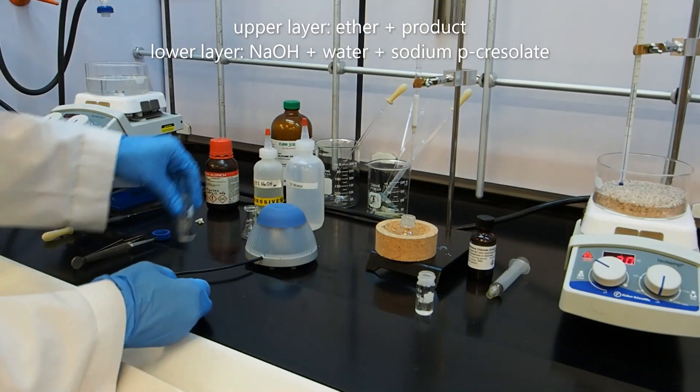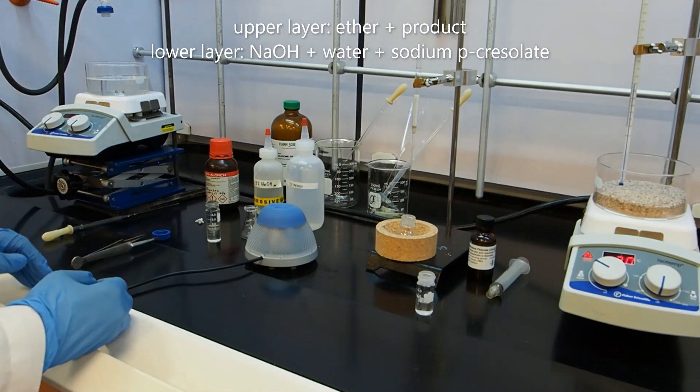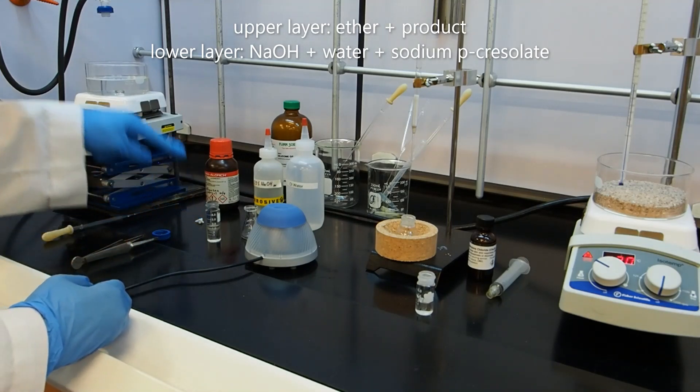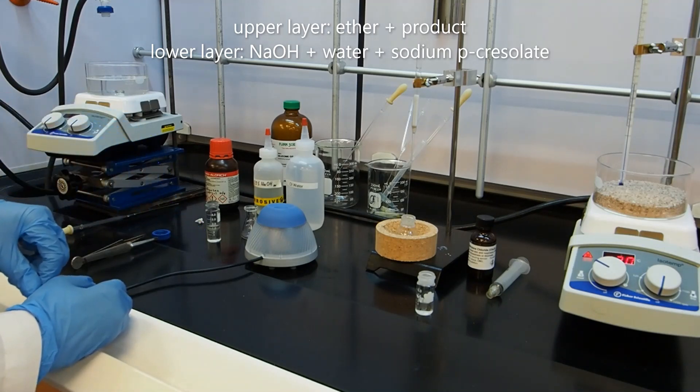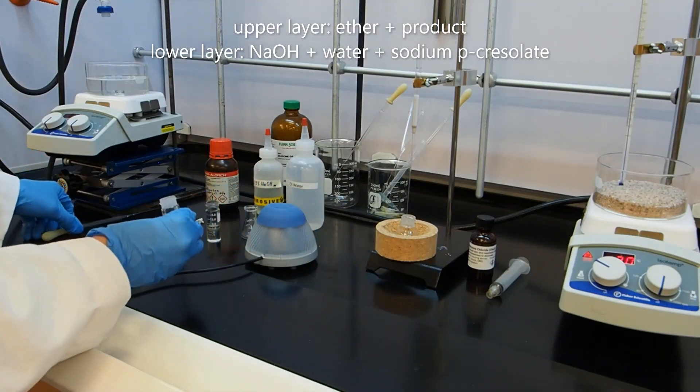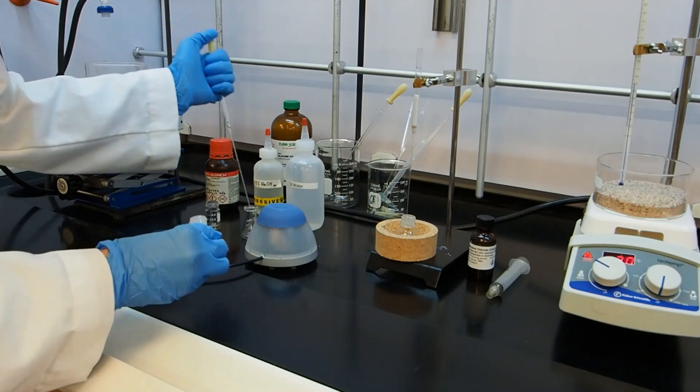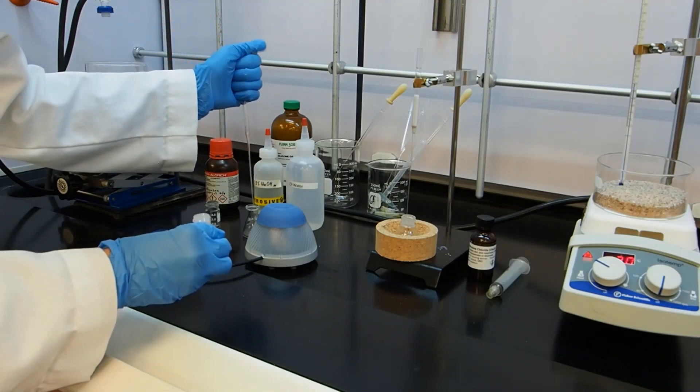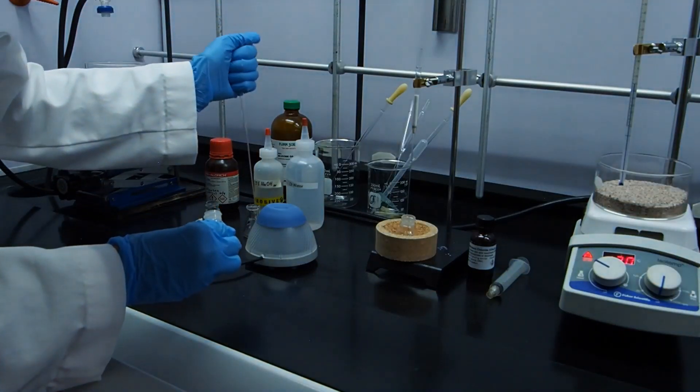So I'm going to do the same thing I did before. I've got two layers. I'm going to let them settle a little bit. The top layer again is our organic layer that should contain our product. And the bottom layer is our sodium hydroxide layer. I'm going to take my aqueous layer from before, and I'm going to put it in this Erlenmeyer flask. Erlenmeyer flask is pretty much waste. Oh, that's great. The lights went out on me.